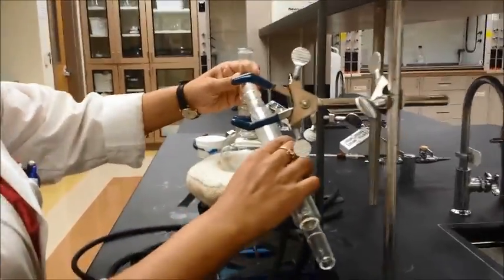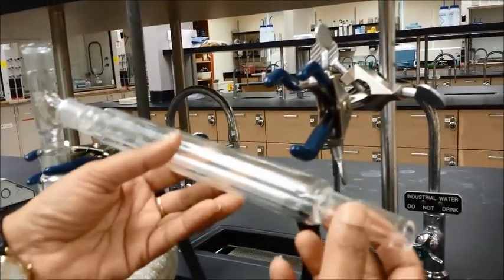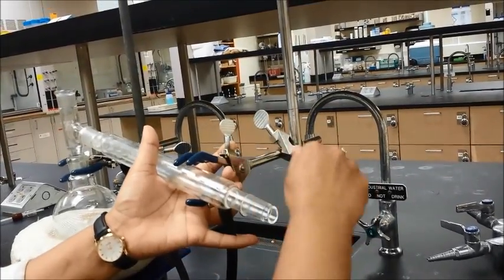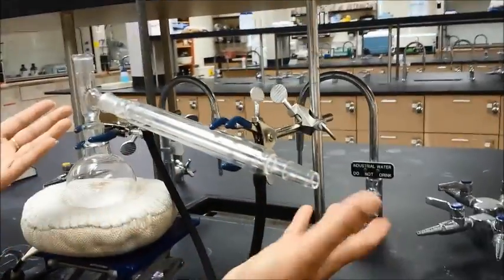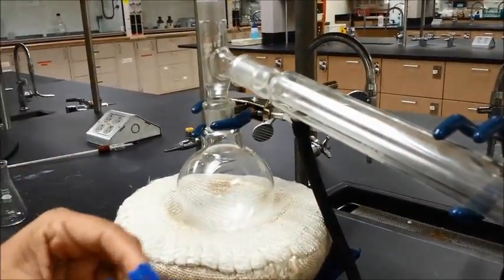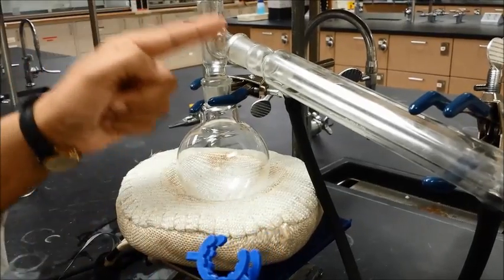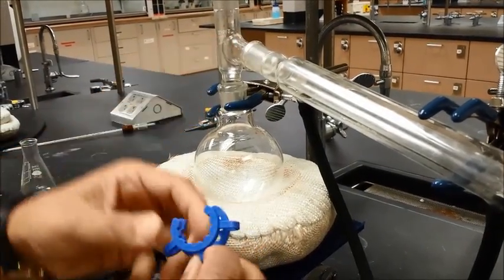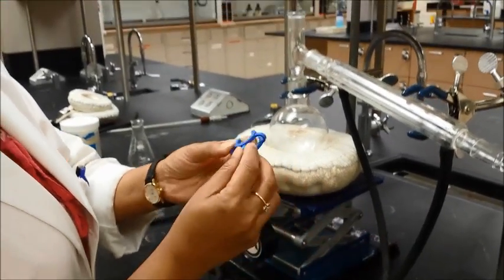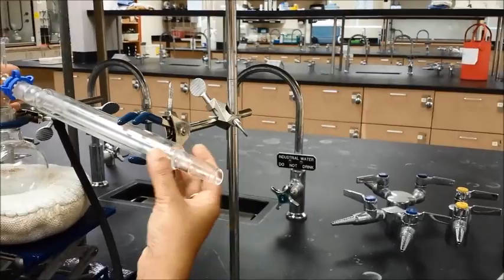Remember, these are ground glass joints so they will fit perfectly. Make sure your clamp comes down here to provide support so it doesn't fall. Set the keck clamp right here so the joint is connected. In the keck clamp you will see there are two C's — a larger C and a smaller C. The smaller C goes on the smaller part and the larger C goes on the larger part. Don't put it on the opposite side. If your keck clamp is broken at any point, it's useless — get another one. This one doesn't need to be tight, but it does need to provide support.